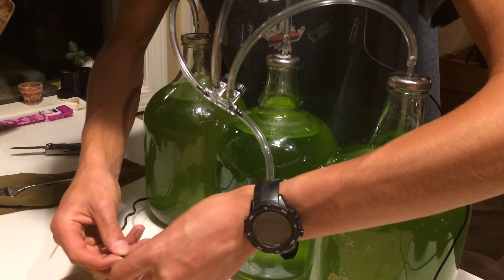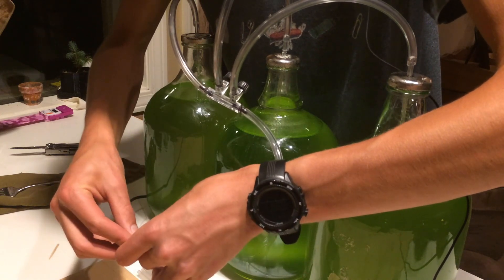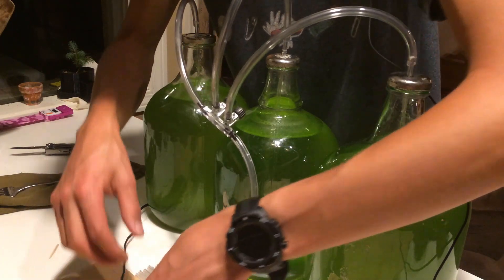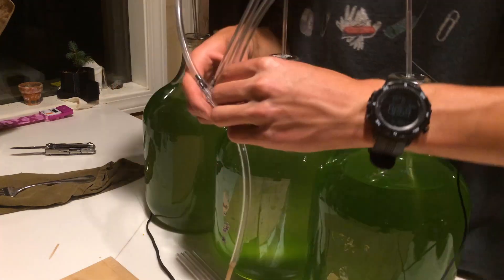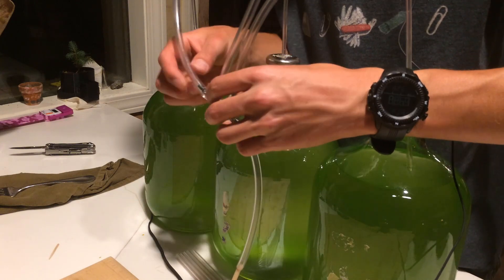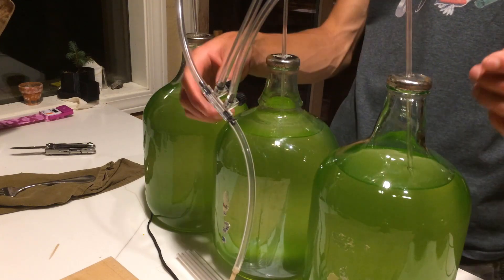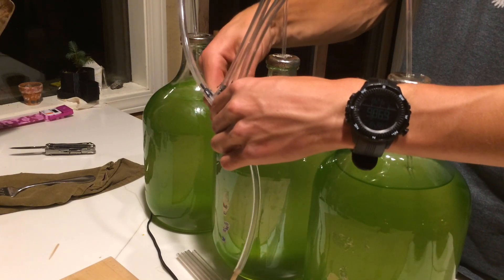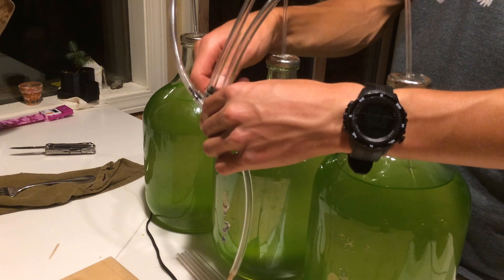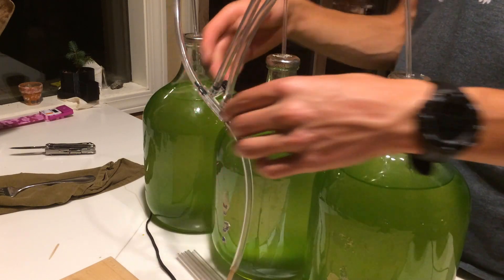There we go. This is leaking slightly - I don't think this little pump is powerful enough to do all three of these. I'll have to order a new pump. Trial and error - at least I got one of them working. I'll do a little update on these when I get the new pump and hopefully when the cultures start densifying.